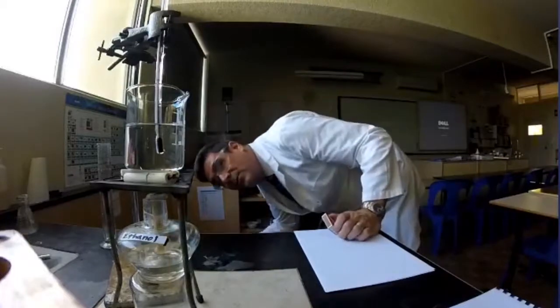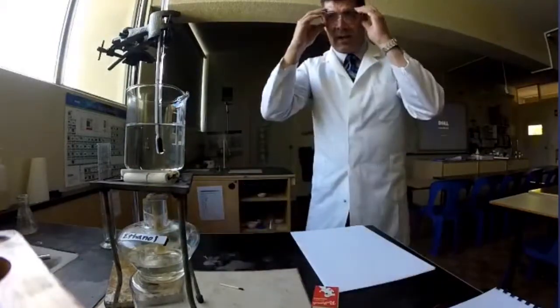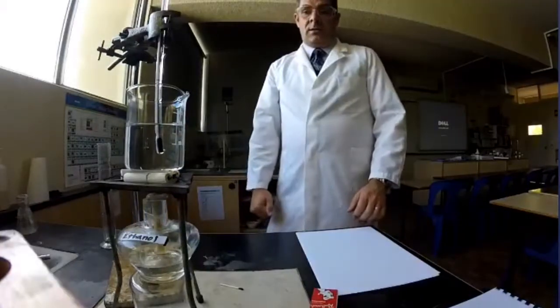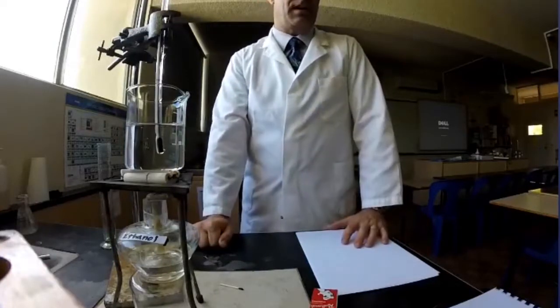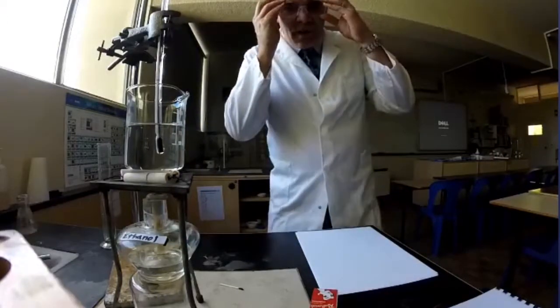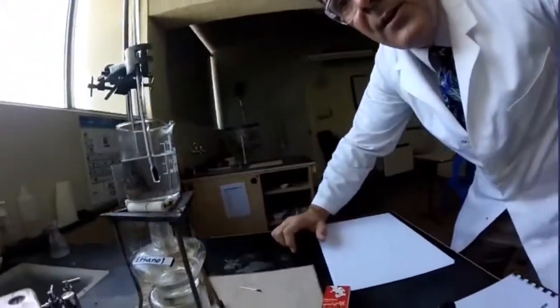as the ethanol burns, it's going to heat that water up, and so we're going to be able to see a change in the temperature. So I'm just going to let that proceed for a little bit. Usually you're probably going to heat for a couple of minutes. That's probably going to be a sufficient amount of time. You may notice that I've tried to ensure that there's a very small gap between where the top of the burner is and the base of the beaker.